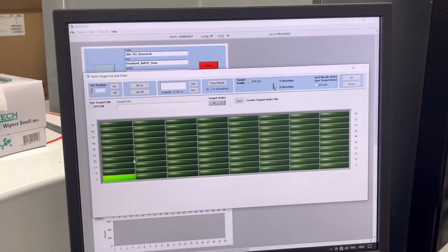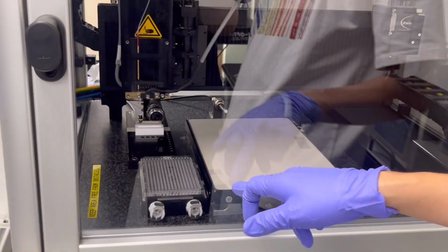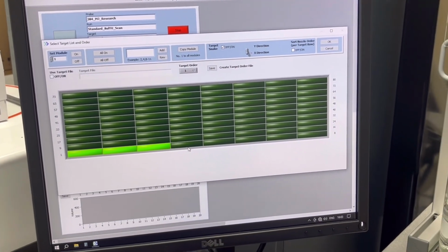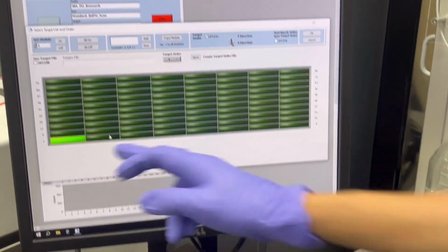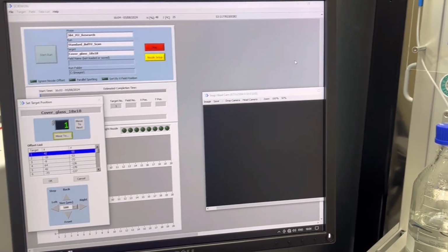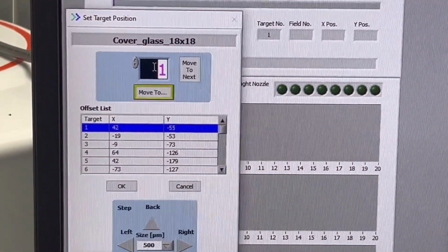And when we click the first position, it means we are selecting the first substrate. If you have many substrates, you have to click for the next place, right? If we use the first one, we turn off the others and open this one only, and we click OK. And then in here they show the number. Number 1 means the first substrate.